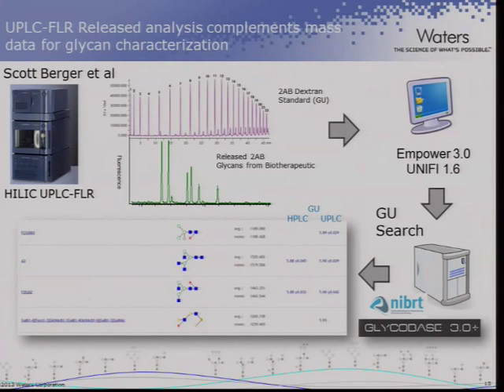So this is on HPLC. These are the glucose units for these structures on UPLC. You look for the glucose unit value. It's got an error bar. So you take your experimental glucose unit. You decide yourself what's an acceptable error. So you then look within this chart to see which of these structures could be that glucose unit.